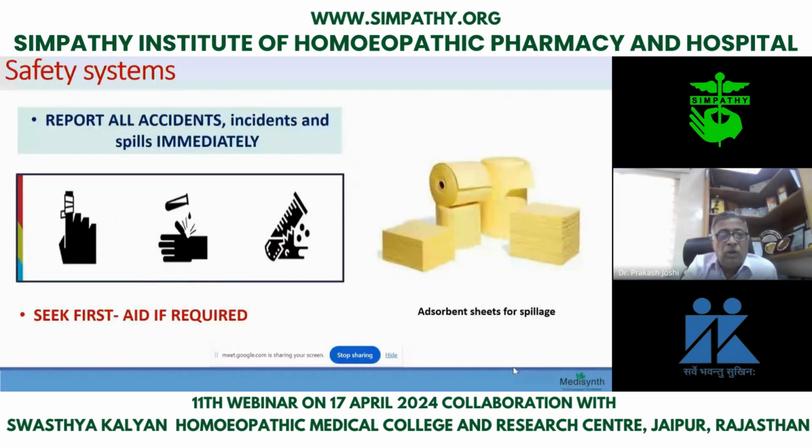Then report all accidents, incidents, spills immediately. If any accident or incident happens and it spills, on the right side you have seen the absorption sheets are there. Because if something falls, the other person may skid and fall. So that is why if anything falls on the floor, there are absorption sheets now that will absorb all the liquid which is on the floor. So these are the basic things a laboratory should have. And all these things make your laboratory an ideal laboratory.